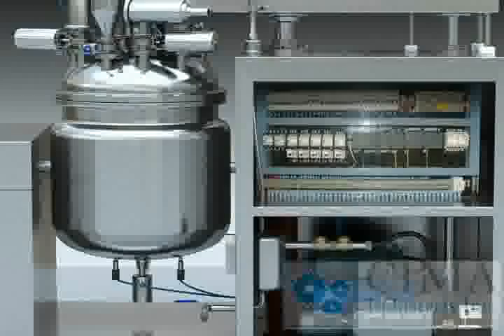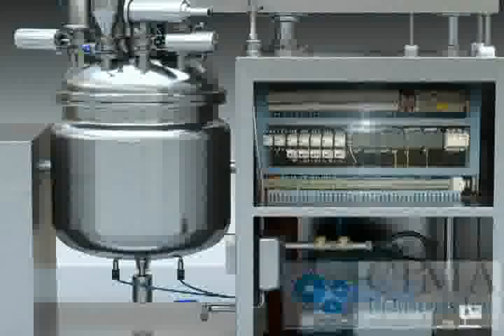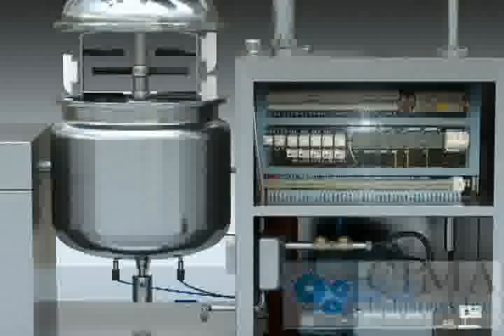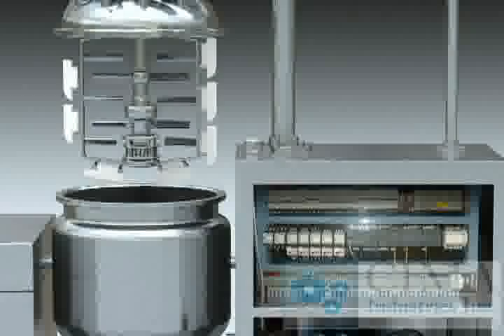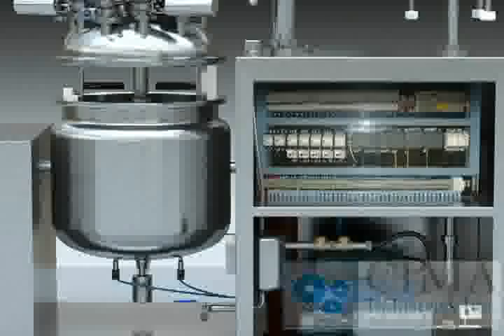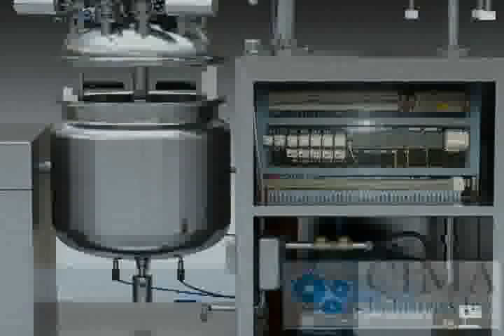The hydraulic system is made up of a hydraulic pump, hydraulic cylinder, reversing solenoid valve, overflow valve, upper limit switch, lower limit switch, discharge protection range, and safety switch. When the emulsifier tank is reset and there is no vacuum in the tank and the safety switch is in position, the upper and lower ceiling heads will start to move up and down. When the upper ceiling head reaches the upper or lower limit, the emulsifier tank tilts, and vacuum protection activates. Everything will stop in the current position if the stop button on the HMI is pressed.